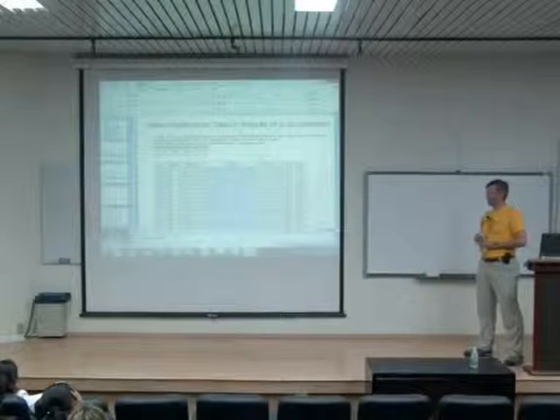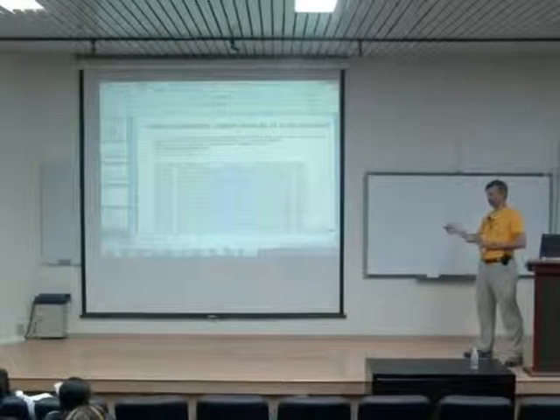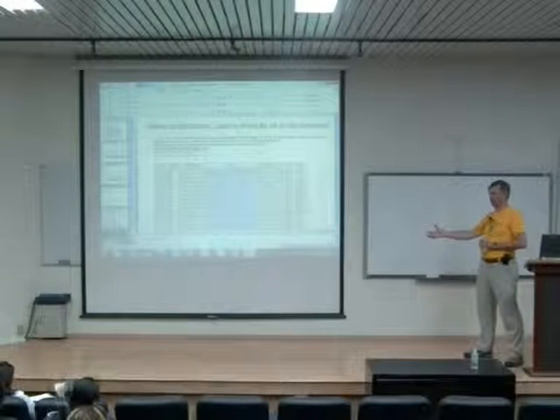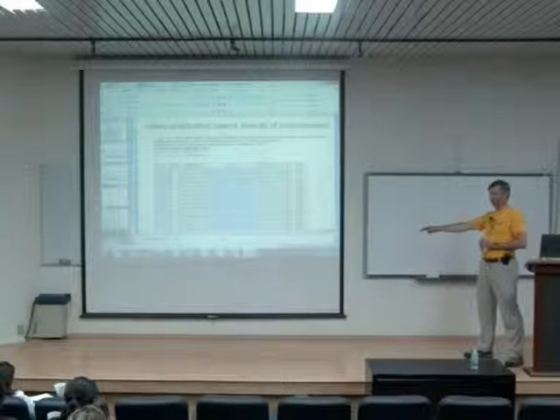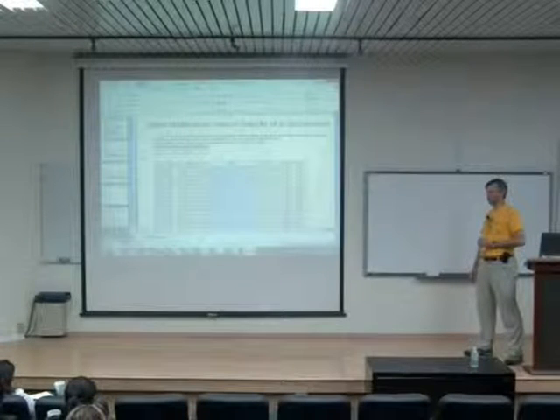This is Orbitrap data, so it's high resolution data. So you can tell the charge from the MS data. You're talking about in the acquisition mode? In the acquisition mode, I don't think we're restricting it at all. You permit all charge states. All charge states. Yeah.